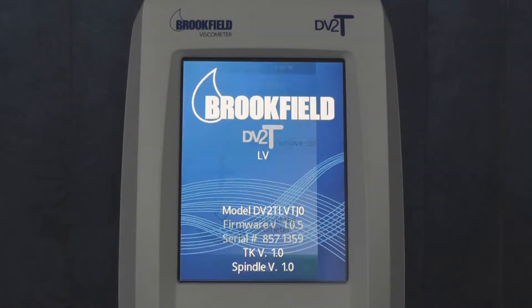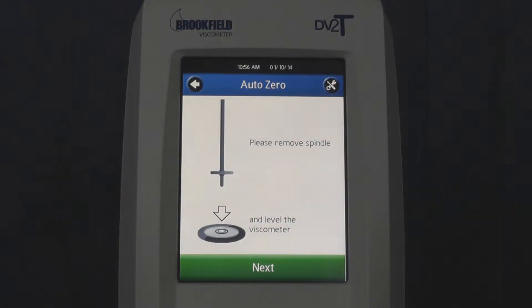The AutoZero procedure will commence once you power on your viscometer. If you choose to require a login, you will have to sign in before this process will take place.